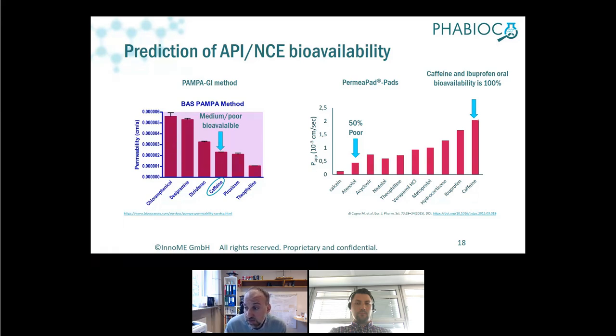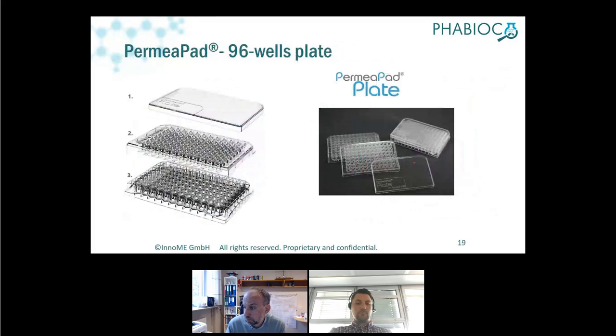And the reason for that is that the Pampa is a partitioning-based barrier, where the drug needs to go from a water-based environment to a lipophilic environment, while here small molecules can go through the paracellular transport and be correctly interpreted in terms of bioavailability.